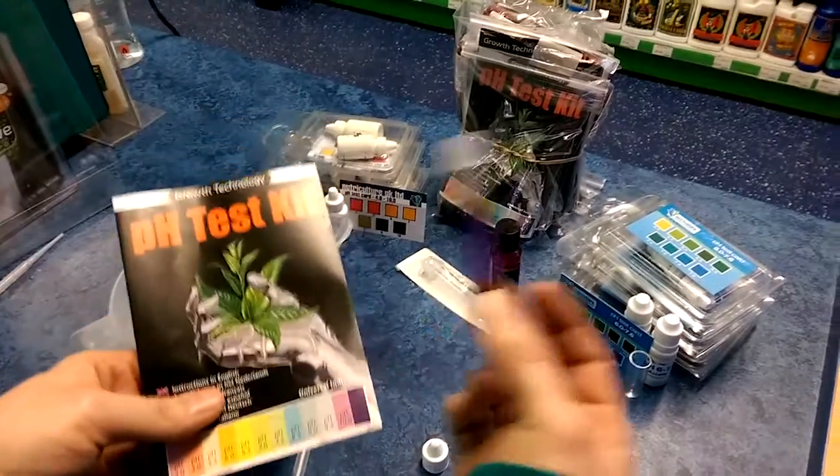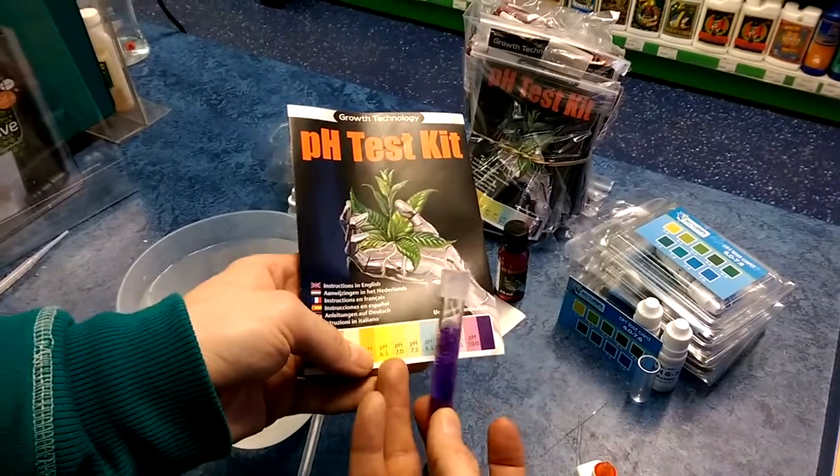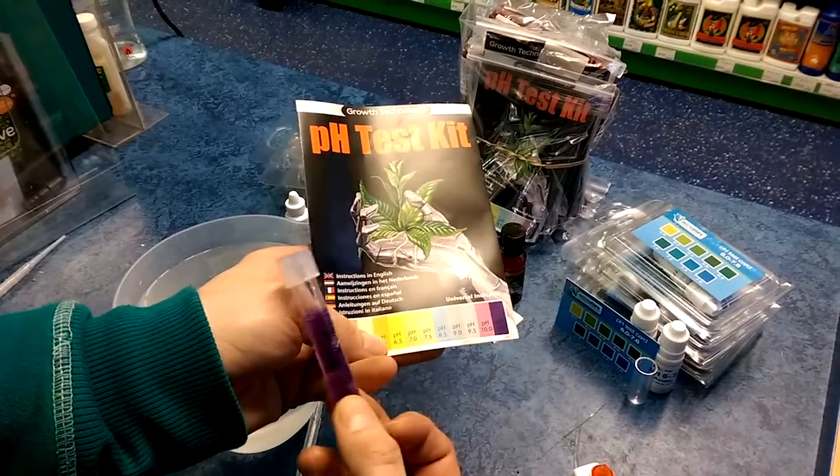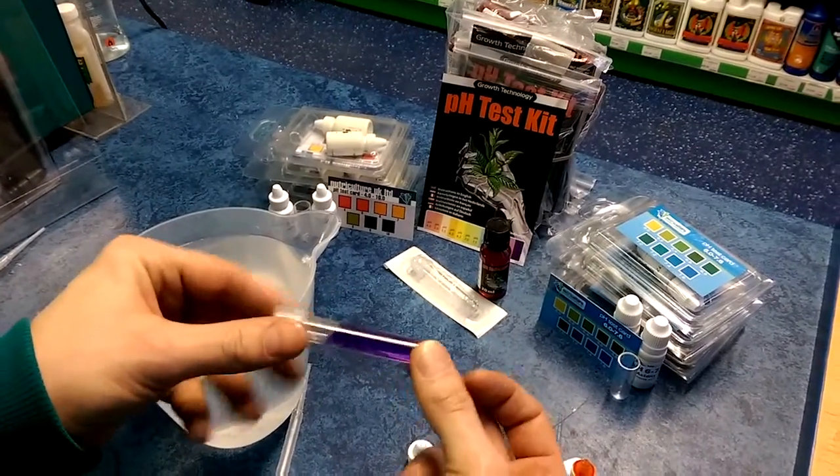You'd apply pH down and repeat the process until it comes down to approximately pH 7, within 6.5 or 6.7. And that is how you use pH chemical test kits.